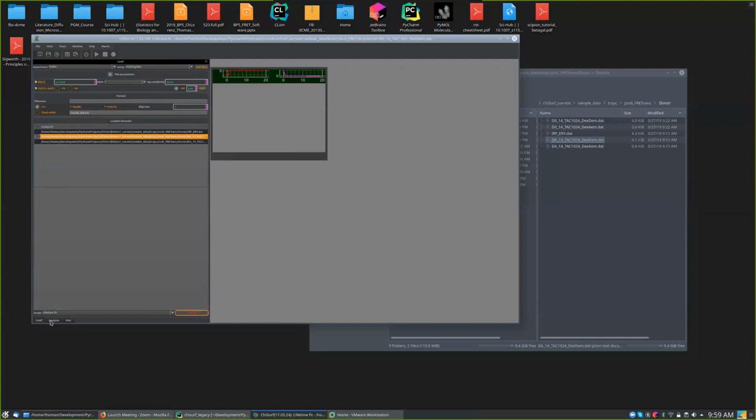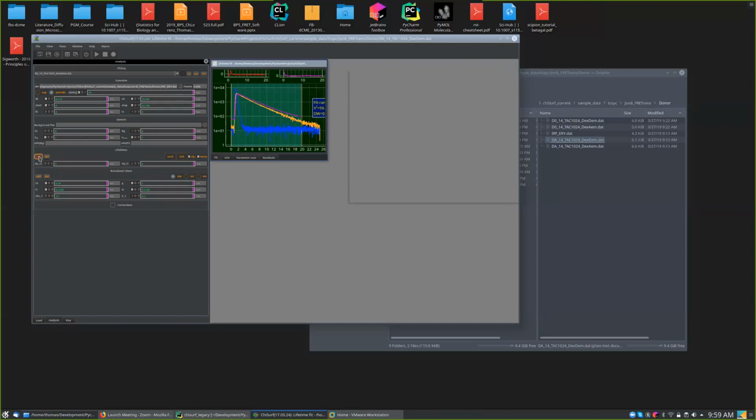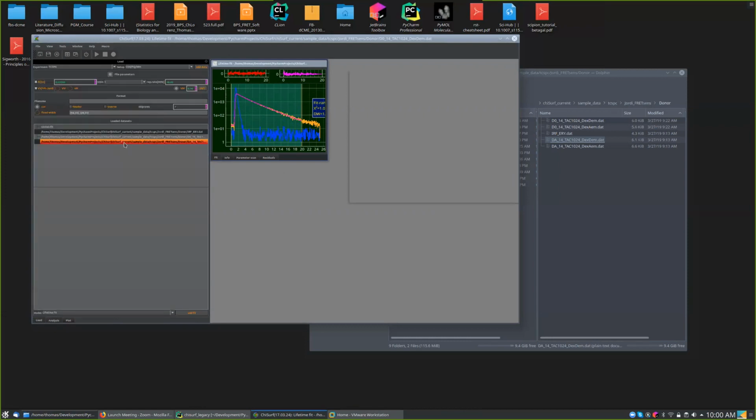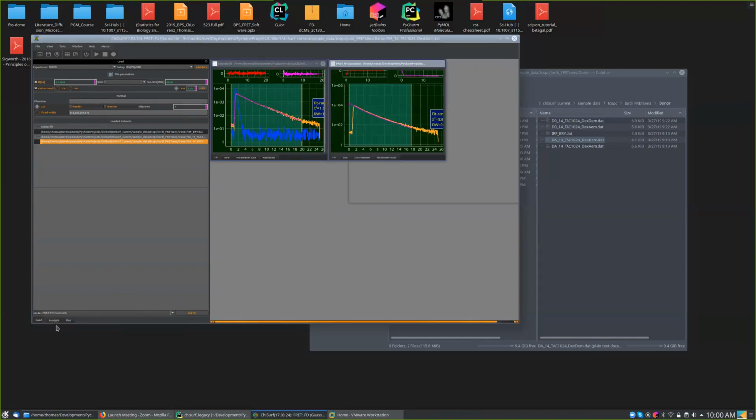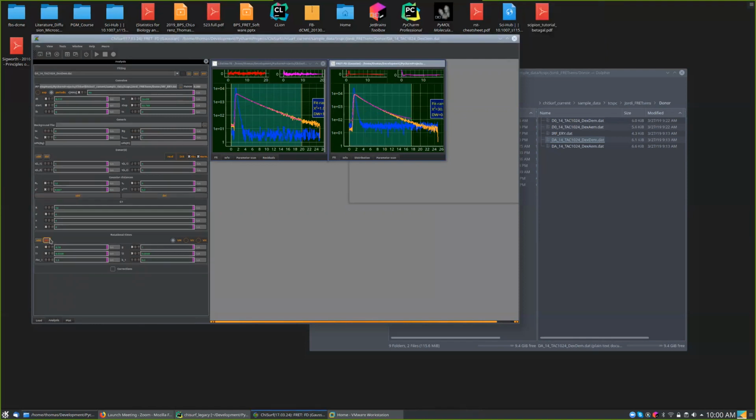At the donor, note the response function, 2 lifetimes, no rotation, fit. Then the sample, donor in presence of acceptor, Gaussian model, note the response function, 2 lifetimes that I connect with these lifetimes, with these amplitudes and lifetimes.